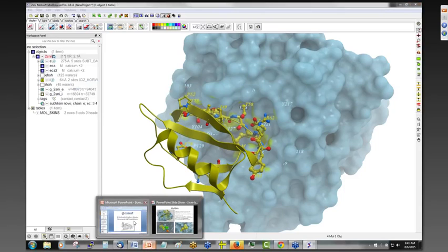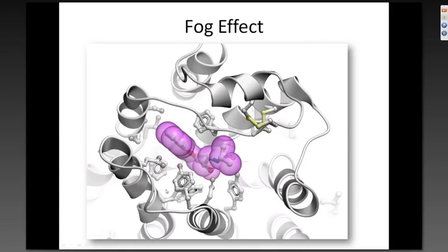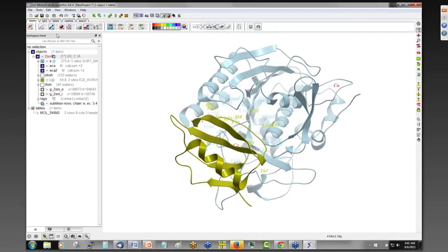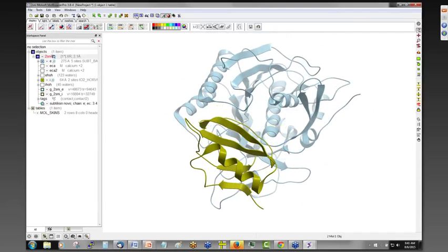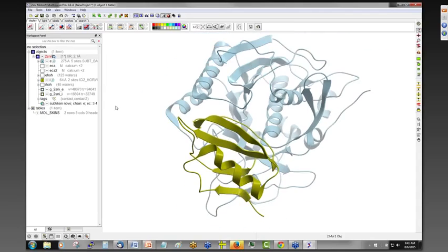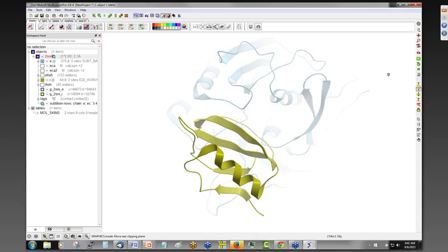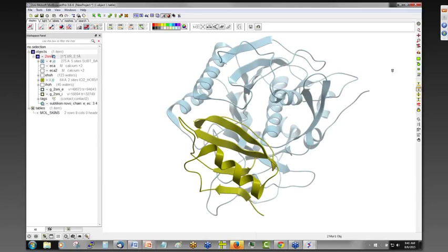So the next graphic effect we can look at is a fog effect. It's pretty straightforward. The fog is turned on using this button called fog. So to select it, and you can then change using these yellow buttons, the clipping plane, so you can add more fog to the background by using the back clipping plane. You can clear all clipping planes here, so back to there's no fog. Or you can also use the front as well, so you can actually cut away the fog, the front.